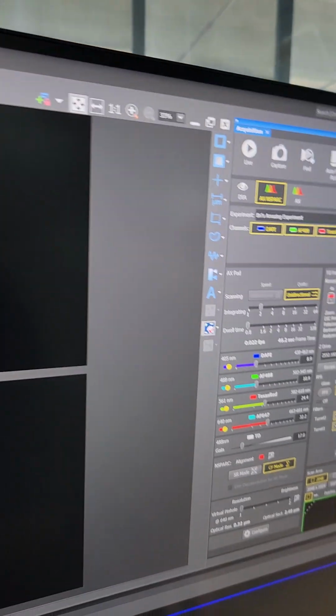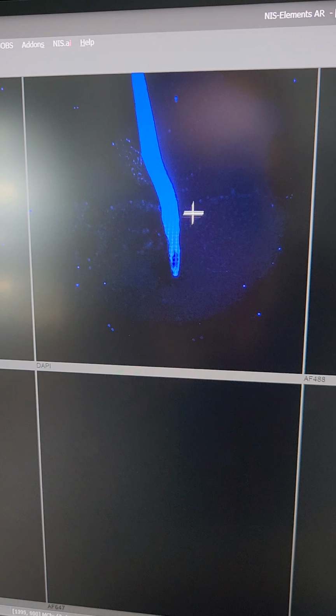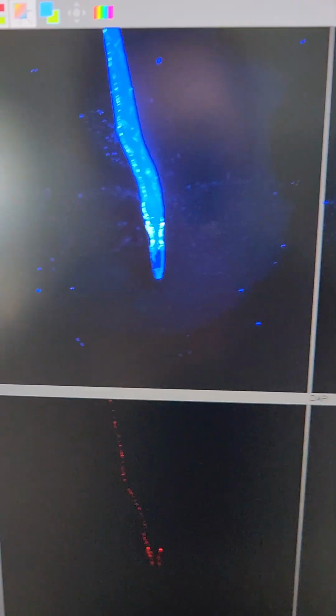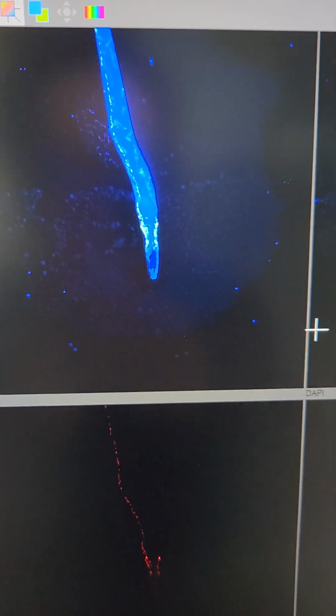And this looks really similar to the green fluorescent protein and the red fluorescent protein. So it'll still work if you click Bree's Amazing Experiment instead of C. elegans. But you also get this pretty blue stuff, and you get to see the autofluorescence of the bacteria in the background. So that's kind of cool. I paused that one and it went a little bit slower because the integrating time was increased to 2, and that was just based on the settings that it had previously for this Bree's Amazing Experiment as opposed to the C. elegans.